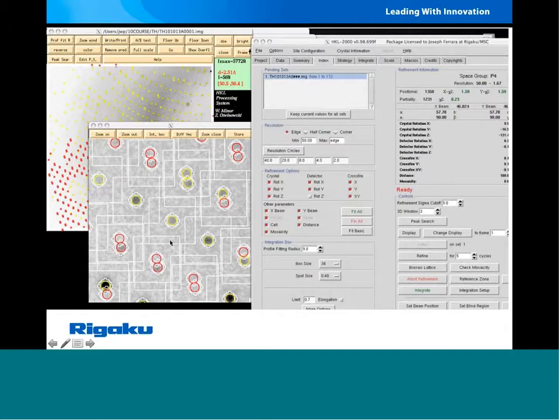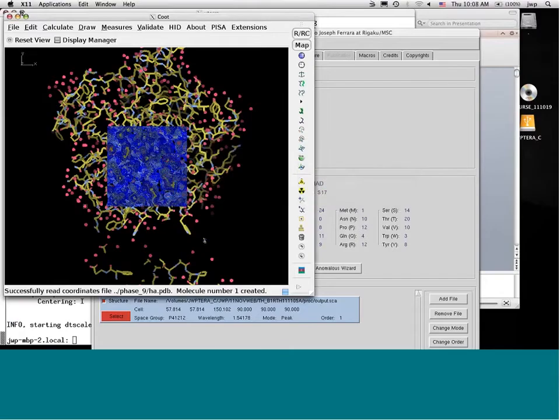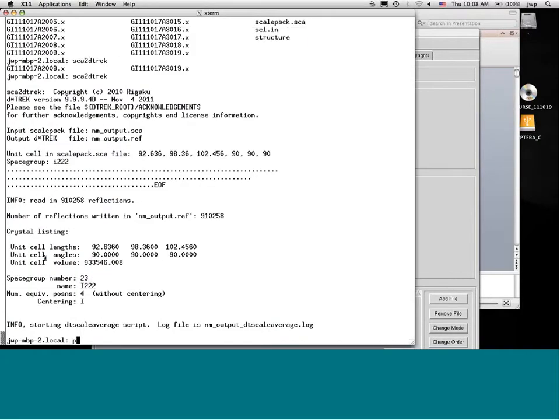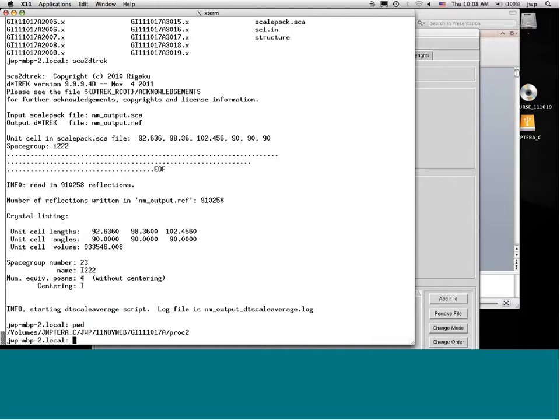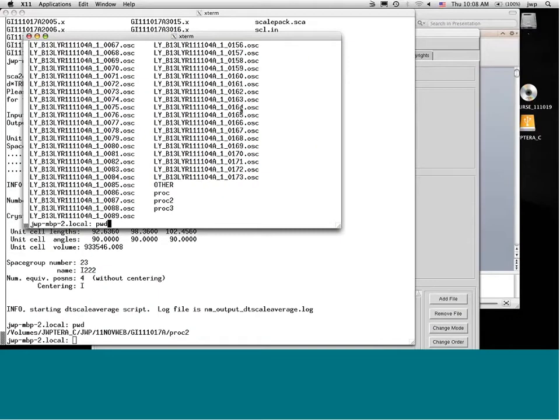And I'll pause now to show you how I get to this stage with a lysozyme crystal here. So one of the things, let's jump out here. And Angela, you're going to have to tell me if this is showing up, my whole desktop. Is that right? It is showing up. Okay, thank you. So I have several windows open here for all my examples.